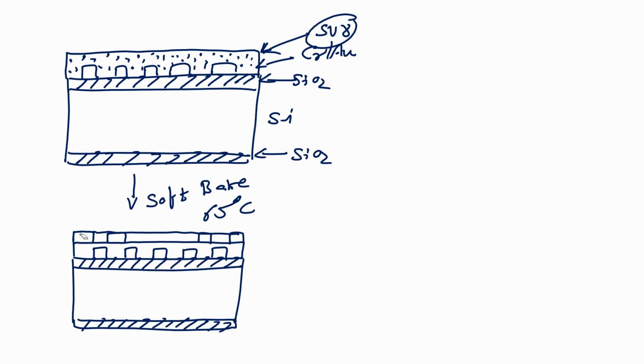No, right? What do you do? We have to open the region over the interdigital electrodes and over the contact area, right.